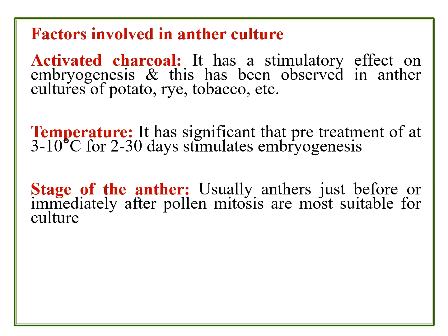So let us see what are the factors involved in the anther culture. Since it is a very organized culture, activated charcoal, temperature, and stage of the anther are very important factors. So that determines the success rate of the anther culture. Here, activated charcoal, in addition to the carbon source, has a stimulatory effect on embryogenesis, and this has been observed in anther culture of potato, rye, tobacco, etc.